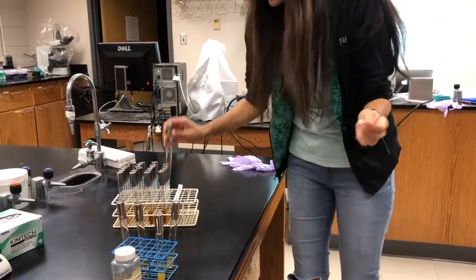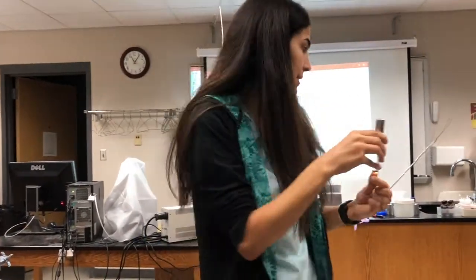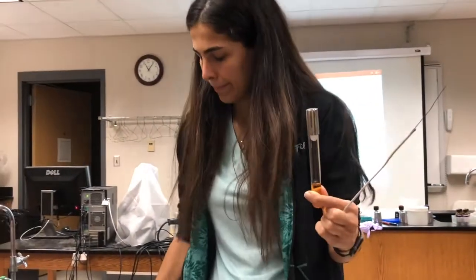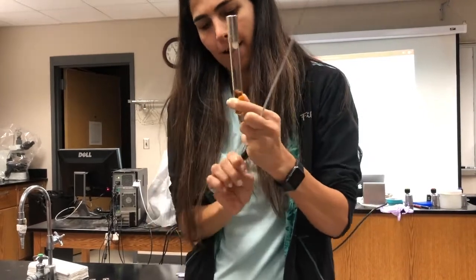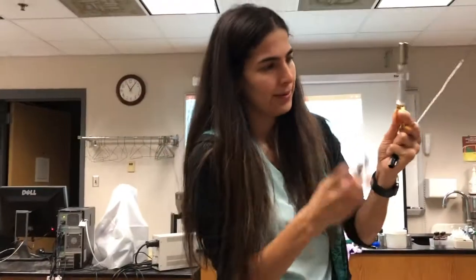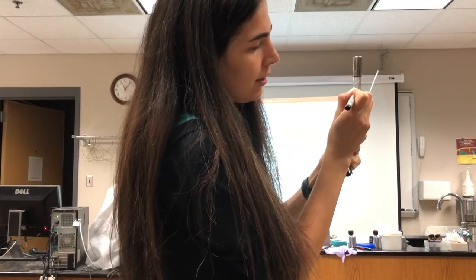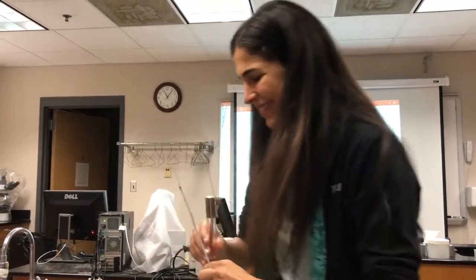And here is TSY broth. I will label it first. E. coli. My loop is still clean.